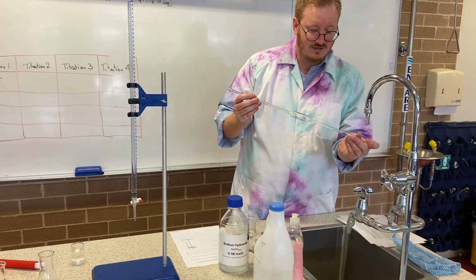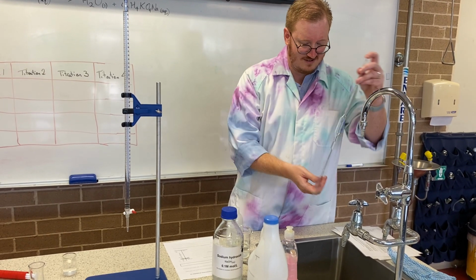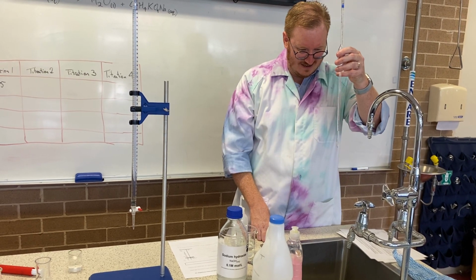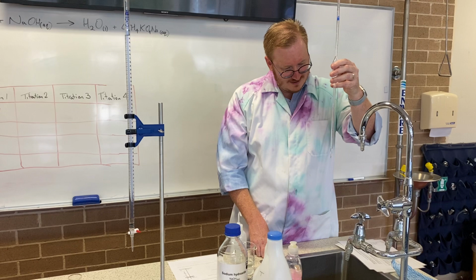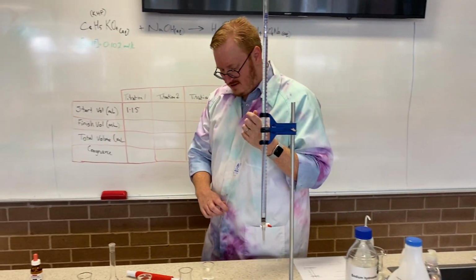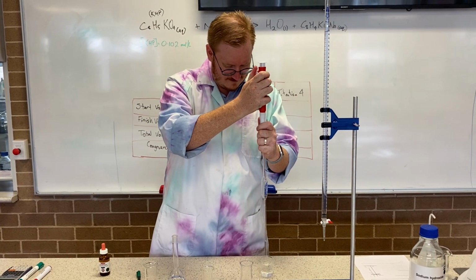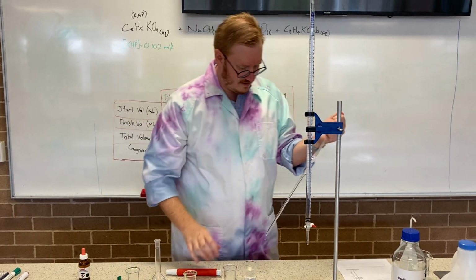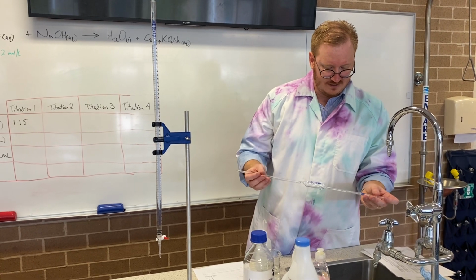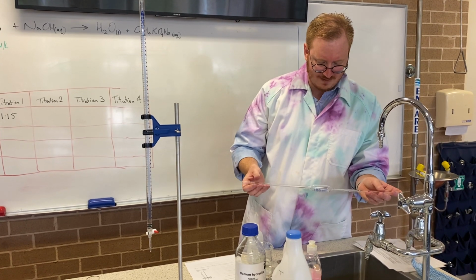And again, I want to rinse all the way to the top. Get rid of as much water as I can. I'll do that twice. No, it's not making for the most interesting video, but it's making for the best chemistry that I can do right now. A little bit in there. Now this is the KHP solution, remember? So I've rinsed this 4 times. That's okay. Gotta be patient when doing chemistry.